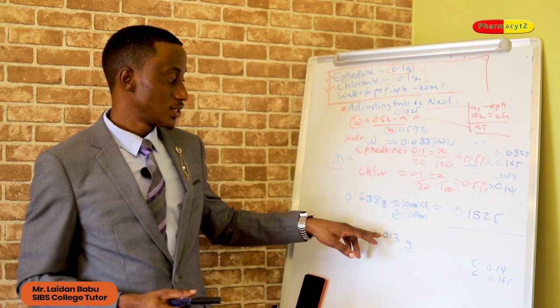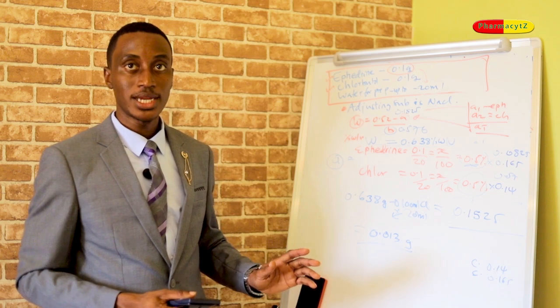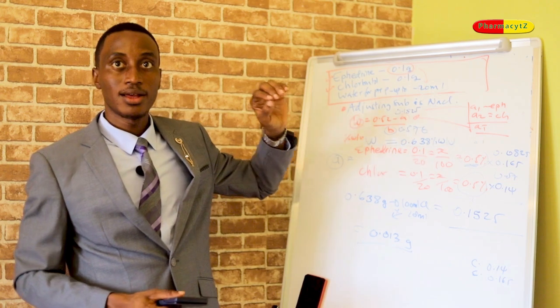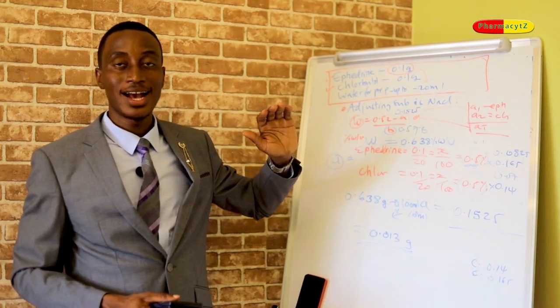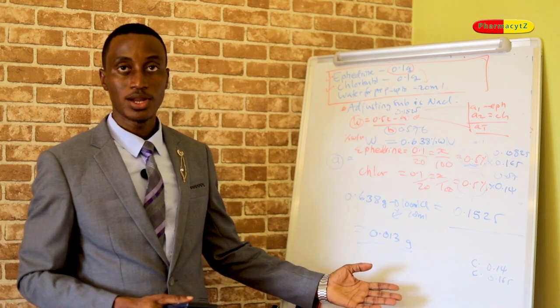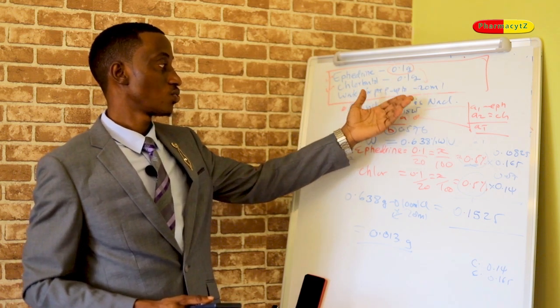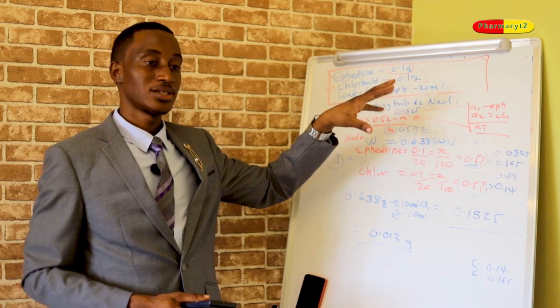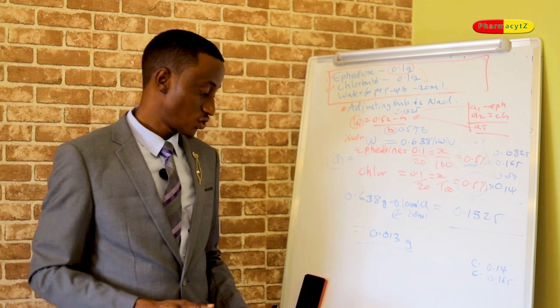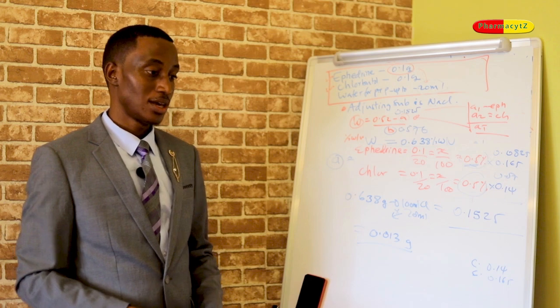Practically, after doing this, scoop or weigh 0.013 grams of sodium chloride, then mix it within this solution. Thereafter, mix it well, it will be already isotonic. Or the other way around, weigh 0.013 grams of sodium chloride, then weigh ephedrine 0.1 gram, weigh chlorbutyl 0.1 gram, then dissolve them in 20 mils of water. Then that is all about using the freezing point depression.